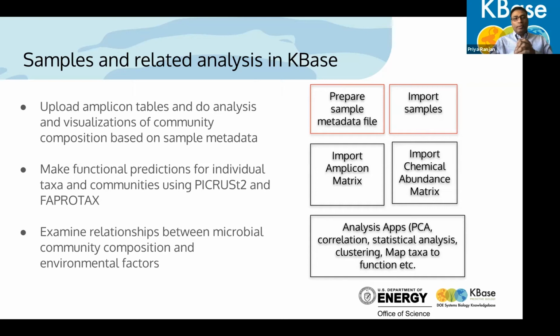You need samples to be able to do that. But then you can visualize community composition based on sample data. You can make functional predictions for individual taxa and communities. You can examine relationships between microbial community composition and environmental factors. Like, I am interested in plant-microbe interaction.